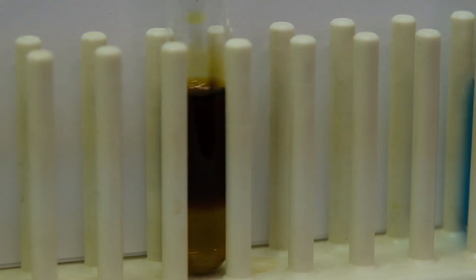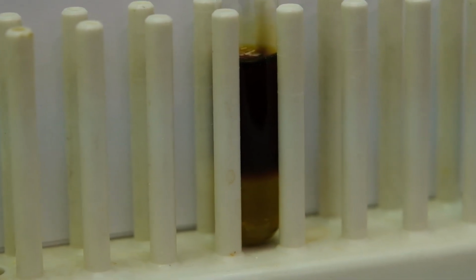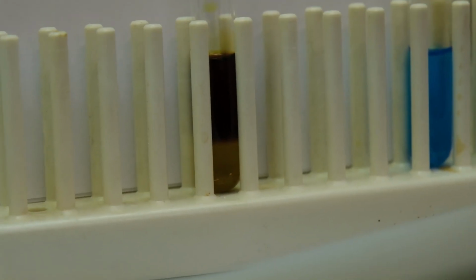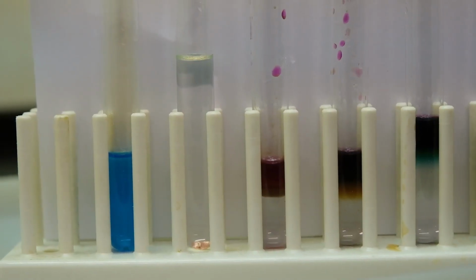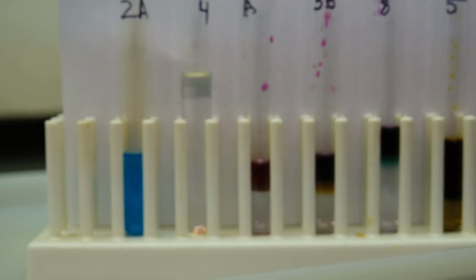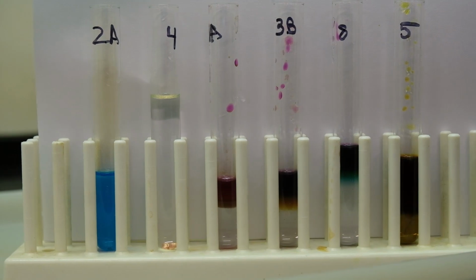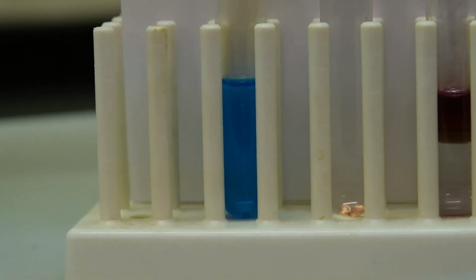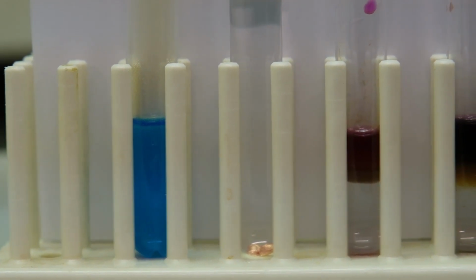Now record any observations you see, like changes in color or precipitation. These are all the systems for experiment 5, so record any changes in color or precipitation that you can notice.